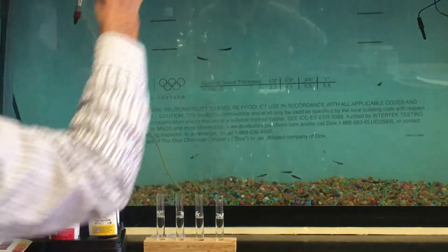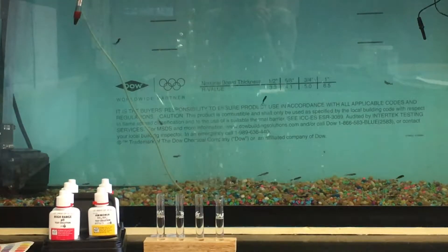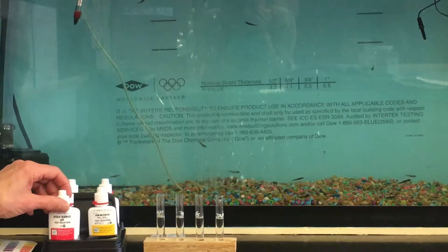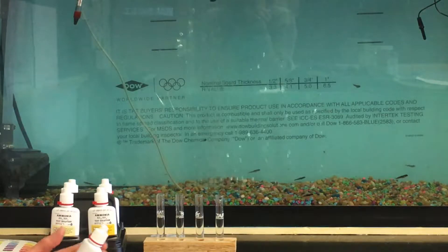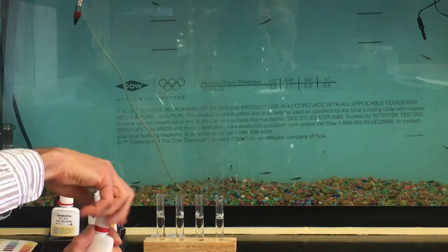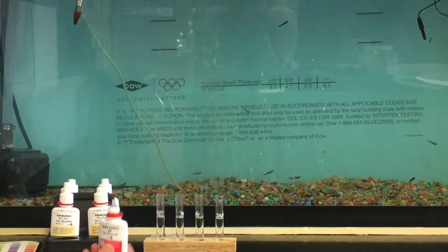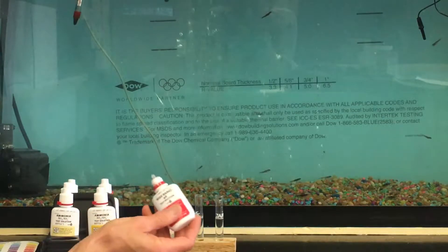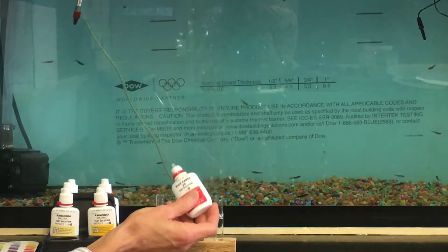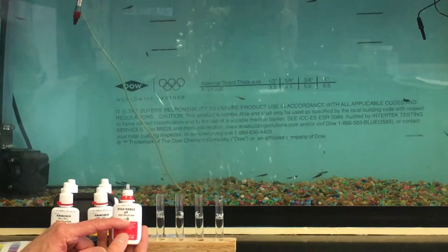We're starting with clean, dry test tubes — that's important. I generally like to rinse them out ahead of time. For the pH test, we open the bottle by holding the red tab with your thumb and unscrewing it. That's a locking safety cap. We're putting the test solution into the test tube.